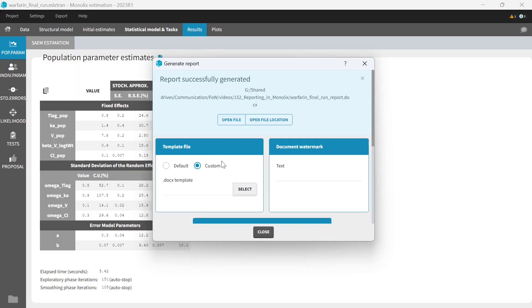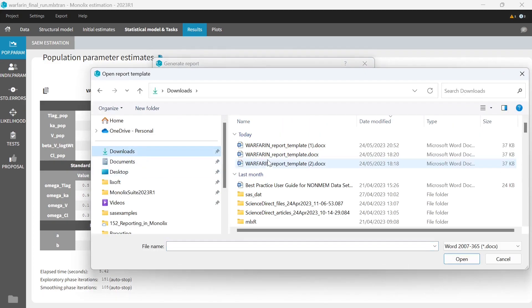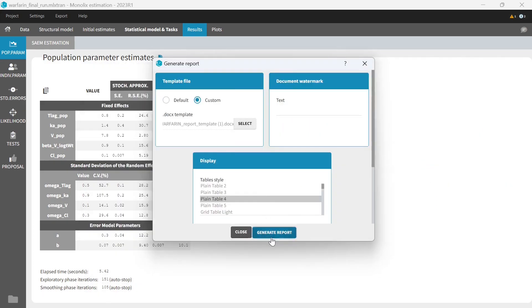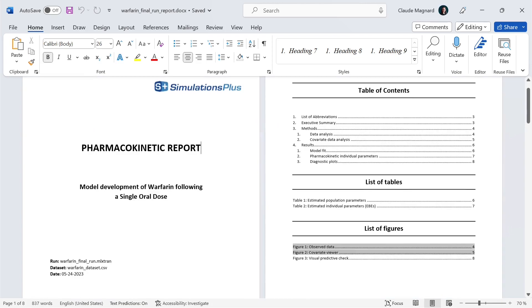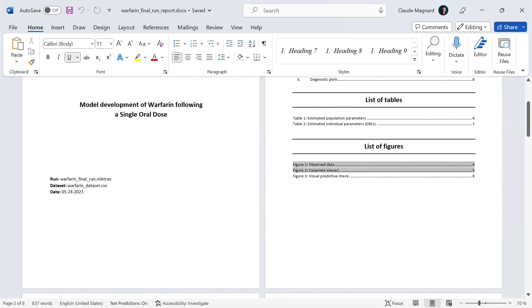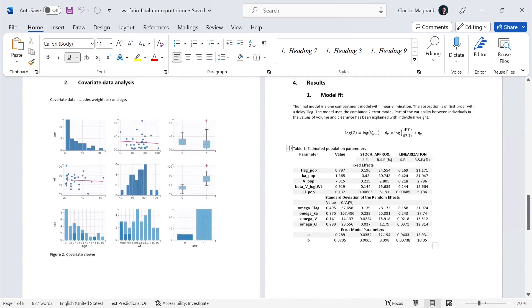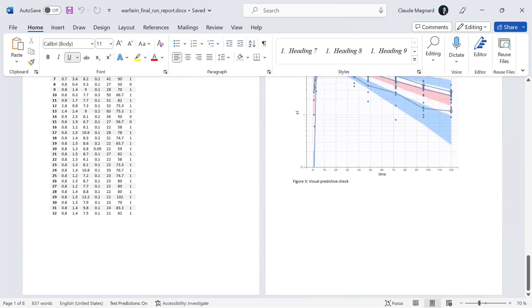So let me use now this template for this run. So you see now that the list of tables and list of figures have been updated. I also have custom plots and tables in that report.